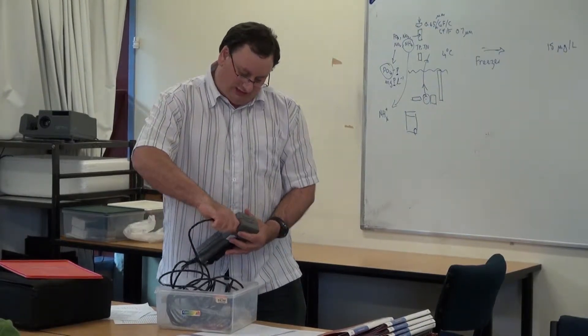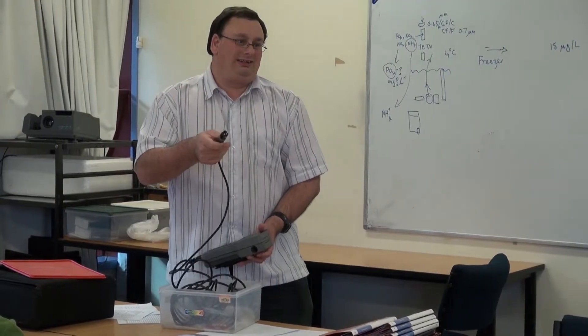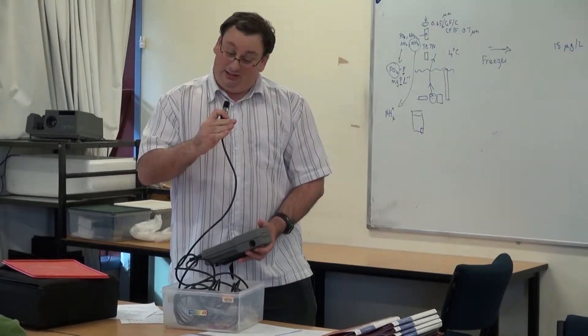Again, you want to check if the membrane is relatively clean, and this one isn't.